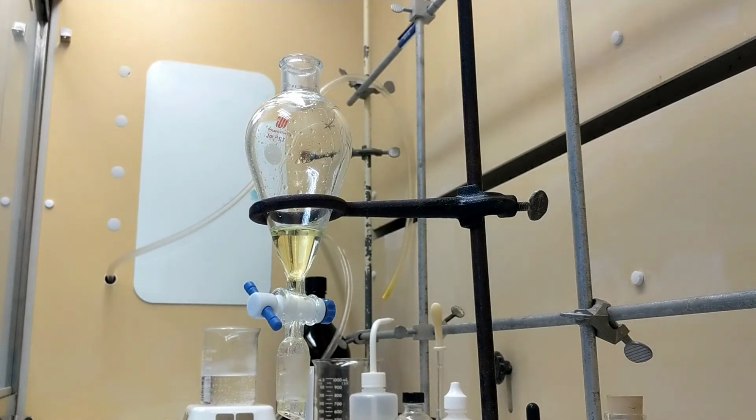Now all that's left in there is the ether. Now I'm just going to take this ether and put it into another Erlenmeyer flask, and then dry it, and then add it to another Erlenmeyer flask that's been pre-weighed, and then evaporate off the ether, and then all that's left is purified unknown A, and then I'm going to put that in the melting machine.